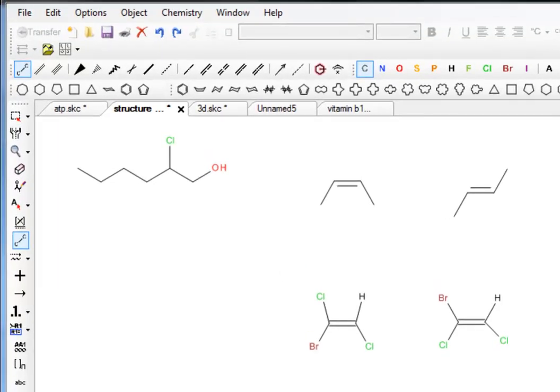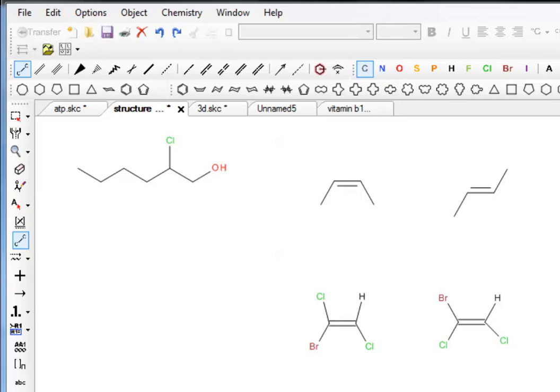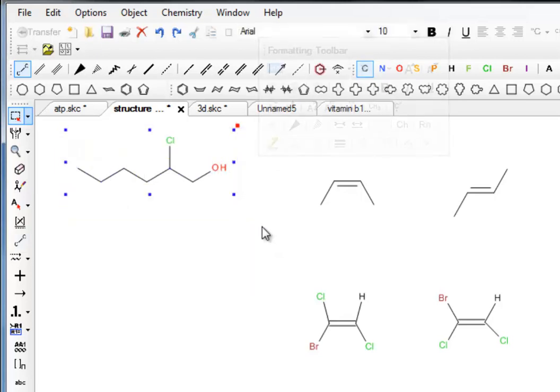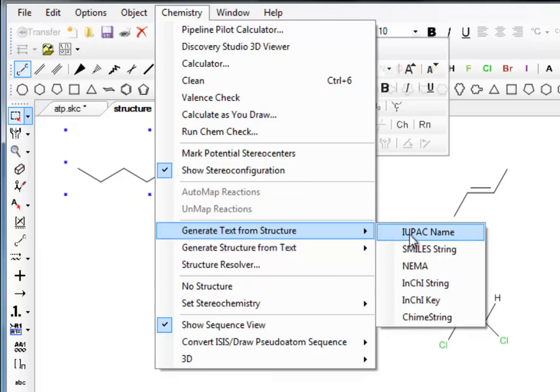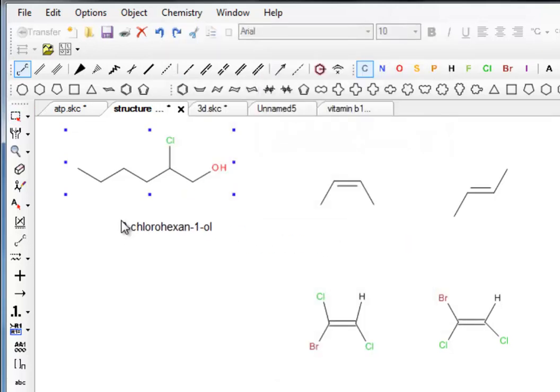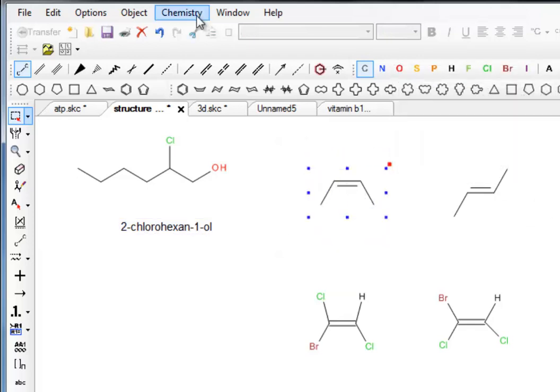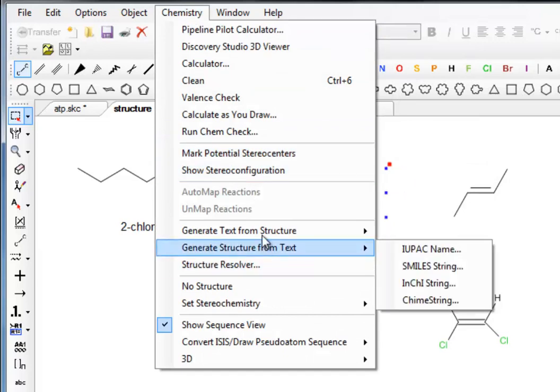One of the things beginning chemists have to do is nomenclature. Here's a structure which would be nice to know the name of when practicing nomenclature. Fortunately, there's a very easy way to find it — just go to Select, select the molecule, go to Chemistry, and there is an option called Generate Text from Structure: IUPAC Name. This gives us the official name from the International Union of Pure and Applied Chemistry. Click there and it tells us it's 2-chlorohexane — you often see that with an 'e' at the end as well; both are equally correct.